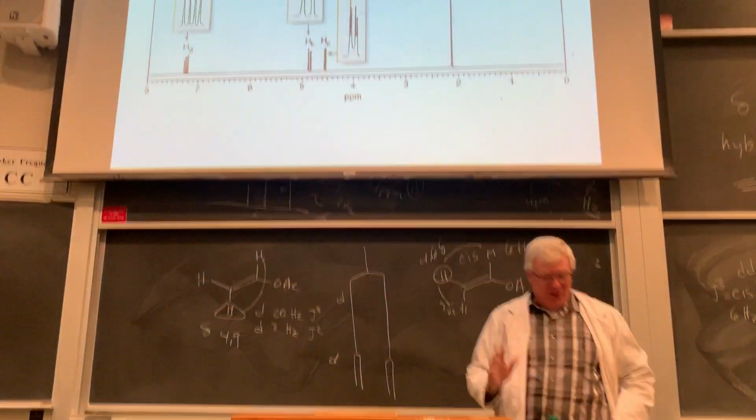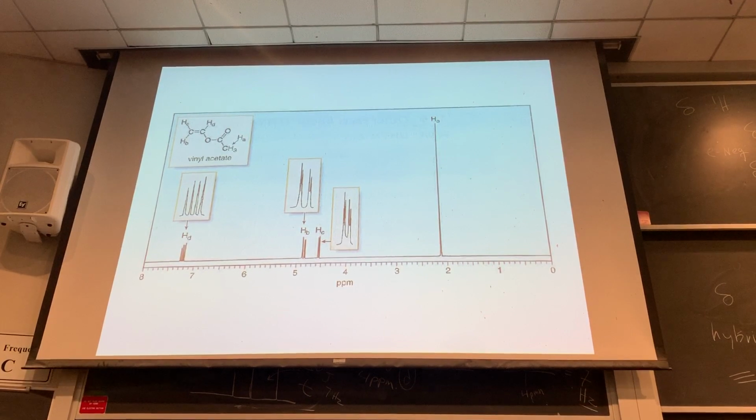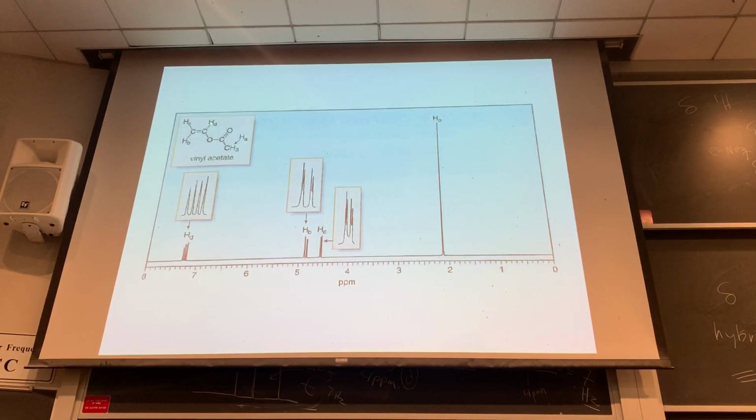All right, let's go up here and see if we got this right. Sorry, just one more. We're almost done. Sorry, it's a little longer, this video. So we got this one here, which is the vinyl hydrogen HD, as we're labeling it. Remember that one has the trans and the cis coupling here. And this is the 20, and then the 6, okay? So you can kind of see that large coupling. The large 20 is from that one, and then 2 lines over, that's 20. But look at the patterns we drew on the board to see that. And that's the furthest one downfield, right? Because it's next door to the oxygen here.